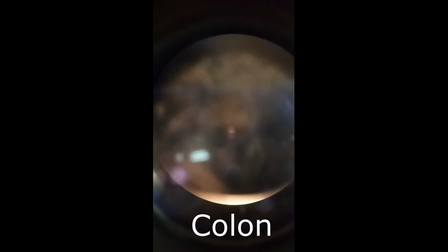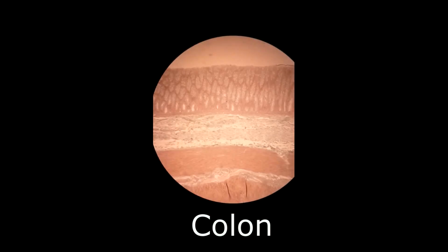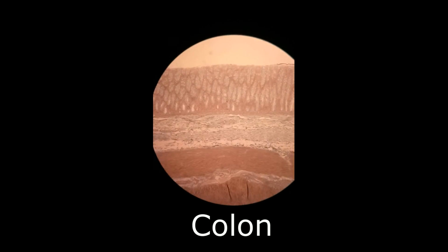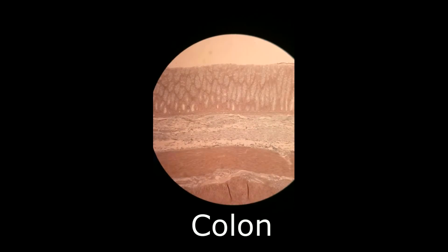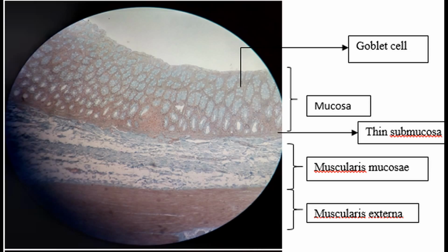Now we start to observe the large intestine colon slide. It's a part of the large intestine. Colon is held in place by peritoneum that supports the abdominal organs. The function of the colon is to reabsorb fluid and process waste products to be eliminated from the body.